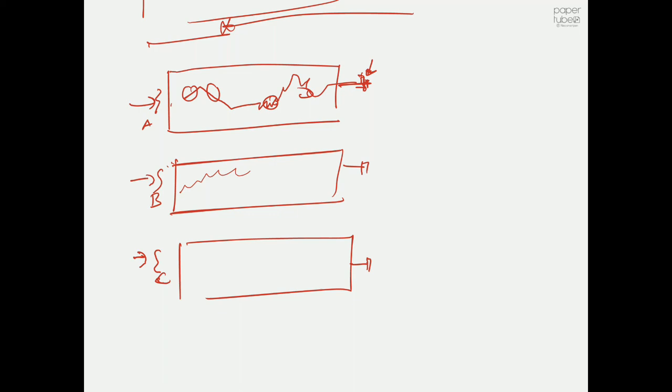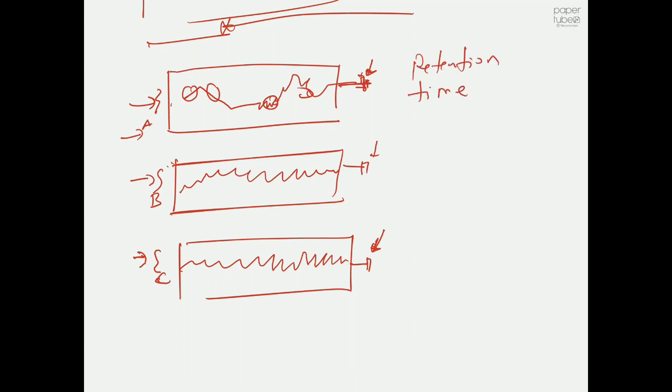So just assume we have some high resolution smart mass spectrometer at this site, which will allow you to detect even that one single molecule dissolved in the mobile phase. Whatever the time spent by the molecule, we call this the retention time. We cannot start to discuss the theories of chromatography unless you know what retention time is, what diffusion is, and understand adsorption, and that there is some adsorption equilibrium happening at different stages.